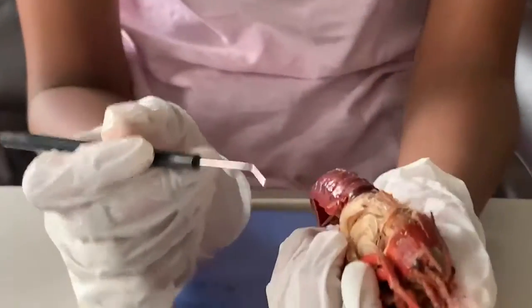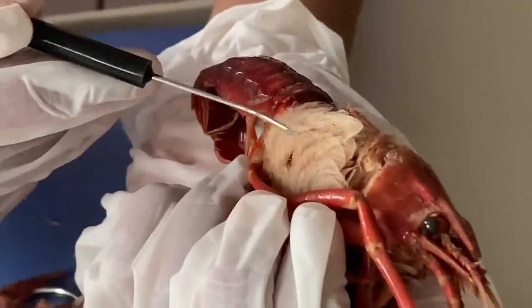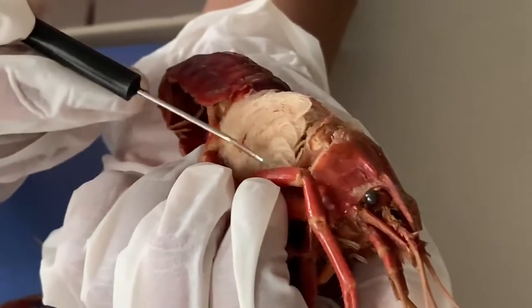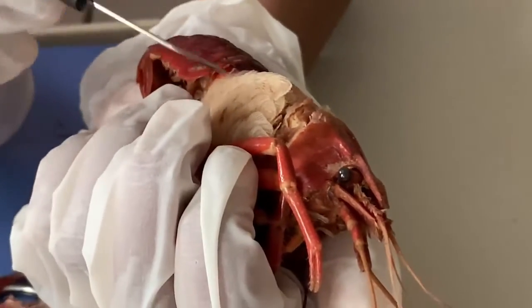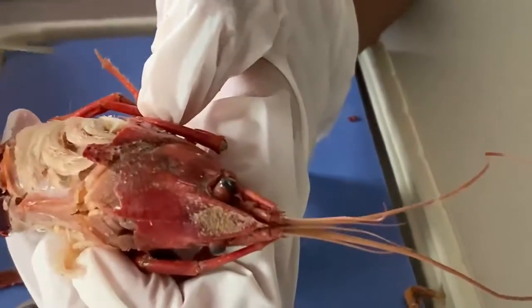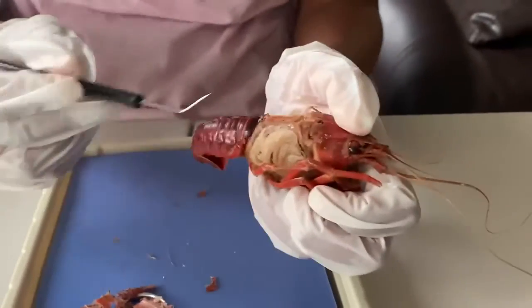The first structure we see here are the gills. These are really easy to spot because they're light and feathery — right over here. The gills' job is for gas exchange: they absorb oxygen and remove carbon dioxide from the body of the crayfish. You can see the gills on both sides of the crayfish. Now I'm going to be removing the gills.